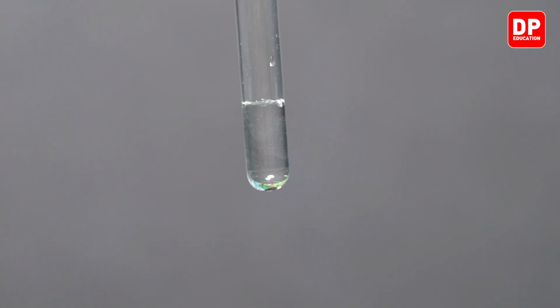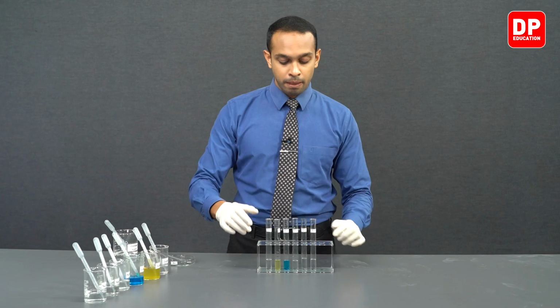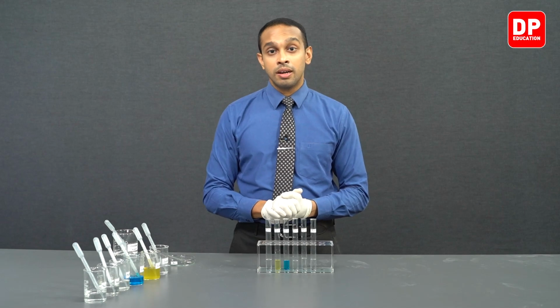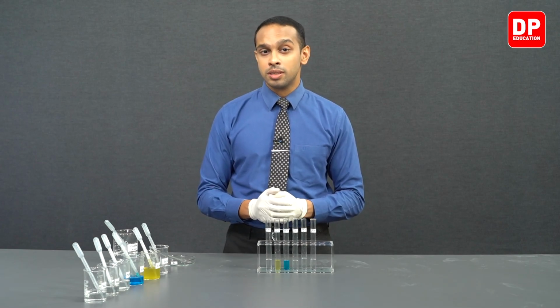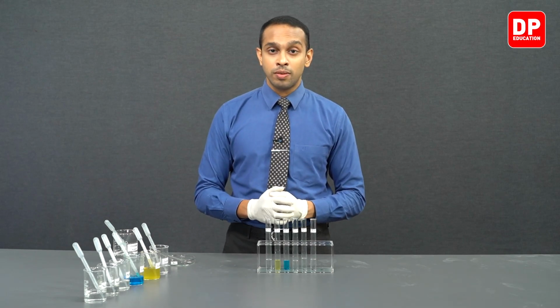Finally, we have sodium aqueous solution added with a piece of metal iron, and we have mixed all of these solutions, and each of these solutions contains a small amount of iron solid in the medium. So we will allow the reaction to take place. It will take about 10-15 minutes. In the lab, if you do not observe any noticeable change, that means you need to allow the reaction to take place for a little while longer. At that point, you will be able to observe some sort of a color change or a formation of a precipitate.